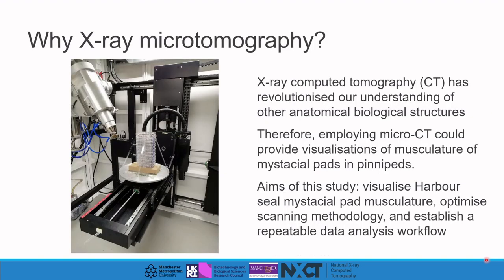We therefore chose to use X-ray microcomputer tomography as the method of analysis because it is a non-destructive method of acquiring 3D morphological data. So, the aims of this study were to visualise the mystacial pad muscles from harbour seal specimens, optimise the scanning method for future samples and establish a repeatable and adaptable data analysis workflow.